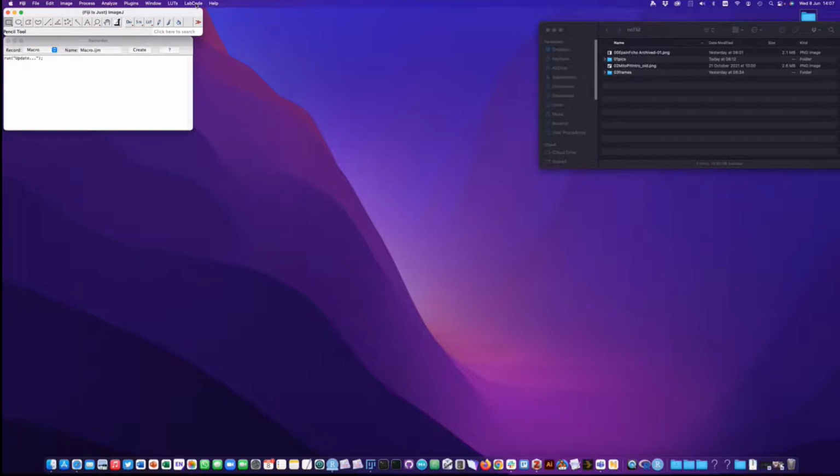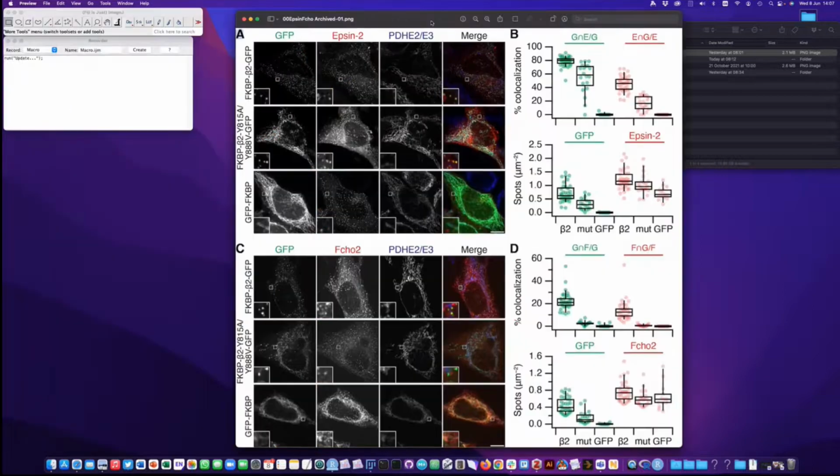But I think actually this video should be useful to show people how to do this kind of the right way or whatever. So the rationale behind this Figure Maker thing was to standardize the way that we make the figures in my lab. There are a lot of ways of making montages and figures in Fiji itself that have been written by other people, but none of them, in my opinion, look very good, and they weren't sort of the gold standard for cell biology papers. So this is why I wrote my own.